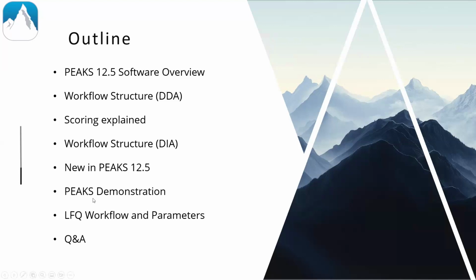And then I will do a bit of a Peaks demonstration, primarily going over some configuration options. And I'll end off with a label-free quantification workflow and a deep dive into the parameter setup. And then we'll end off with a Q&A where if there was anything I wasn't able to get to in this talk or you want clarification on anything, you can ask questions then.